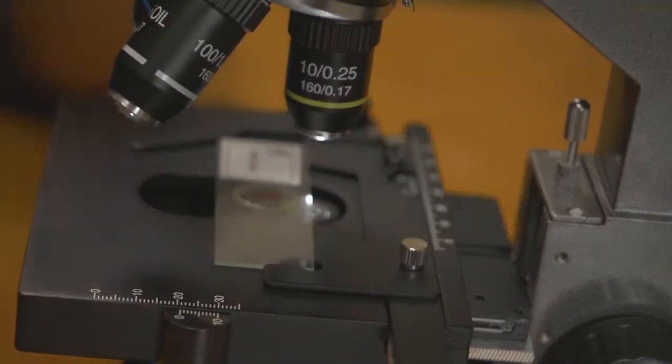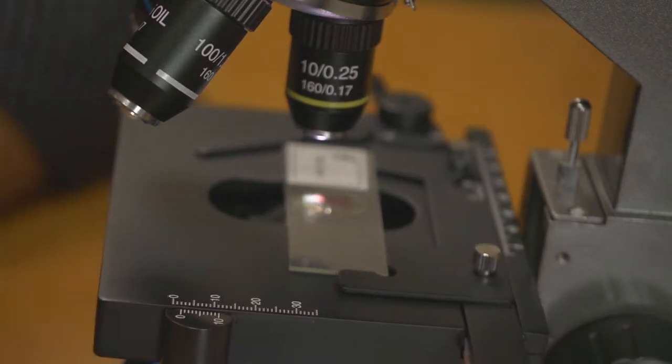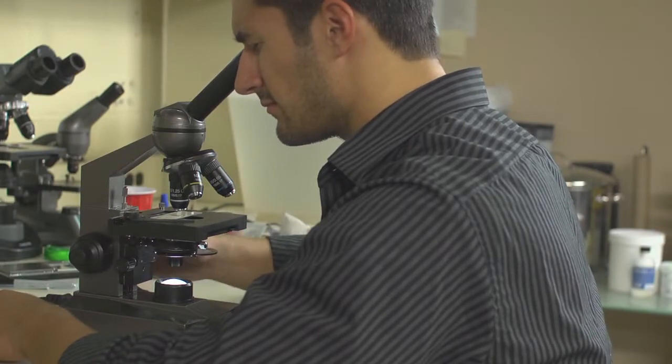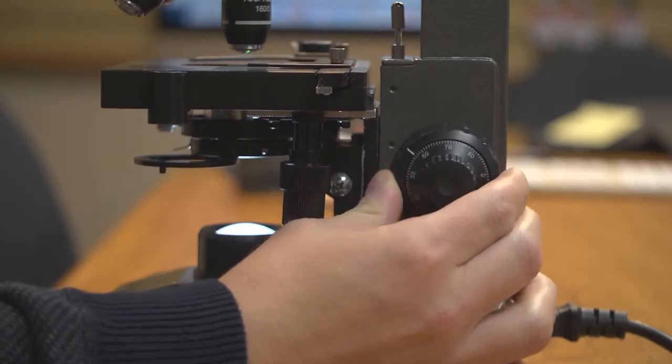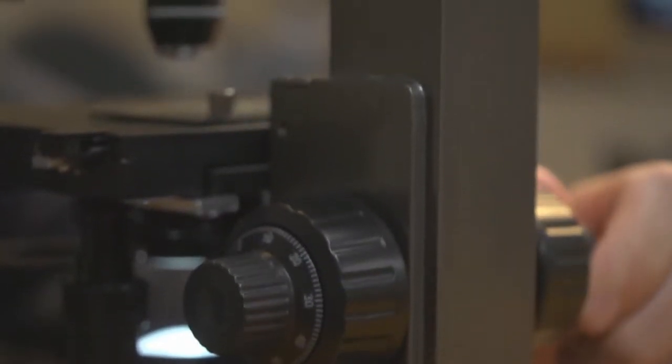We've also added linear scales on the sides to help you measure how far your slide is actually moved. When focusing in on your specimen, you now have much more precision thanks to the fine and coarse adjustment knobs on both sides of the microscope. This feature deals with the height of the stage and really helps when trying to get a specific amount of sharpness.